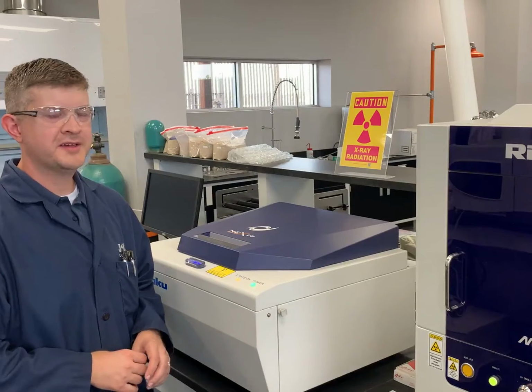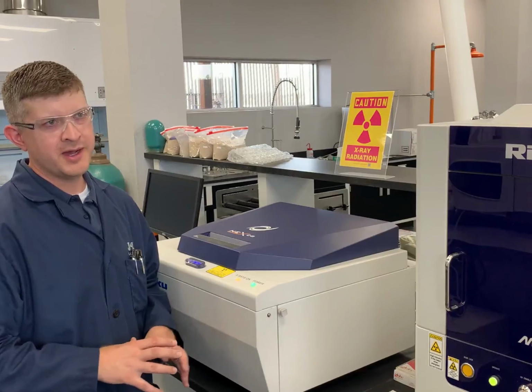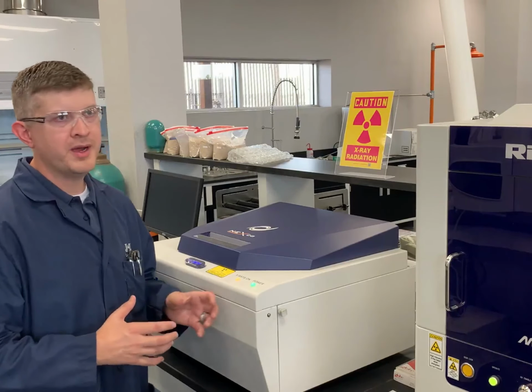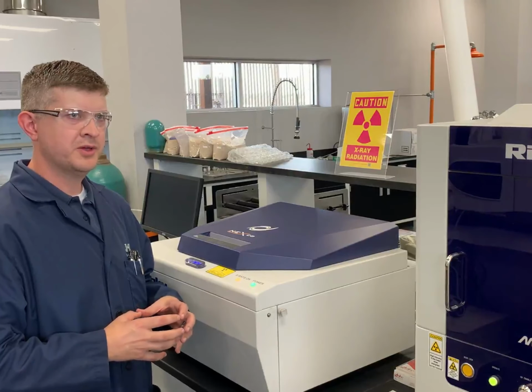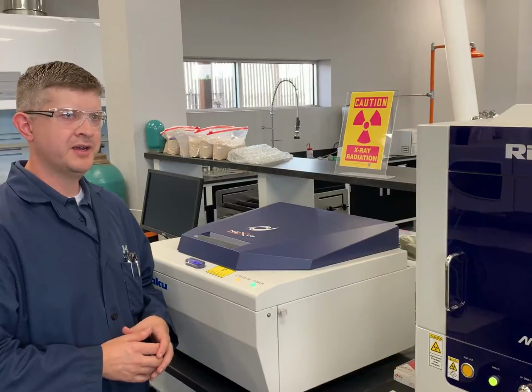So XRF is X-ray fluorescence. It operates in a similar way that the ICP does, where you have a barium atom, the X-ray hits it, the electron will jump up to a higher energy orbital, it'll end up bouncing back down to ground state.